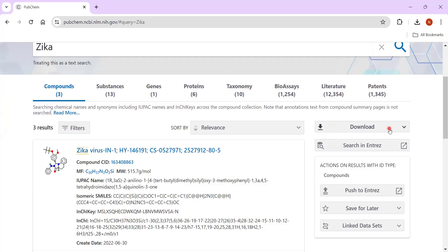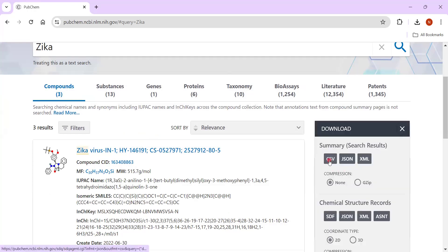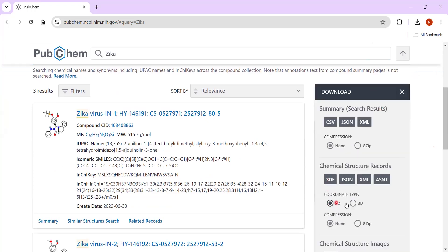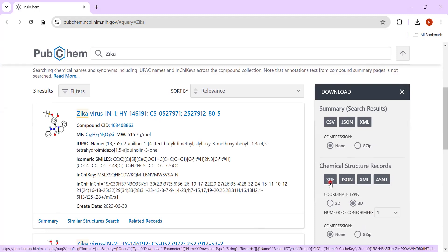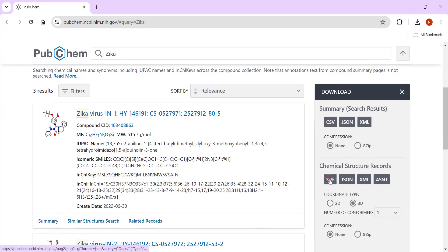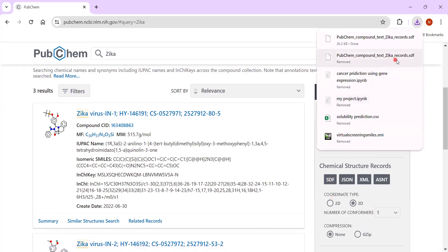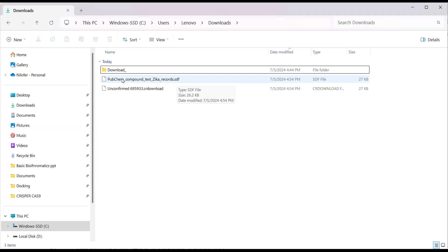You can see the download option is there. Click on download. For AutoDock Vina molecular docking, it's good to click download and then select 3D, and then proceed with the SDF format. All three drugs will be available in the SDF. Once you click 3D, you can see the list of SDF files appear in your downloads folder. The data is available which contains PubChem compounds of the Zika records in the SDF file format.